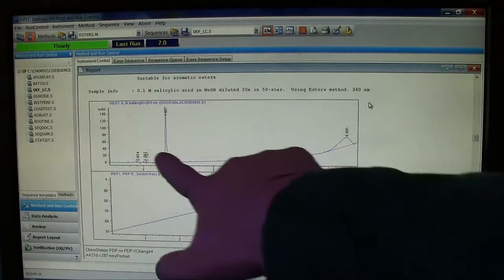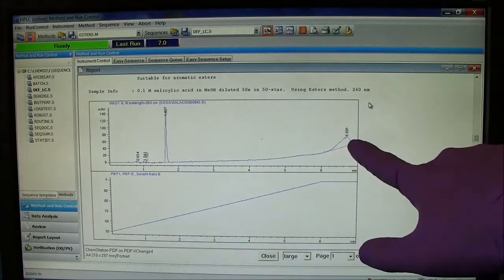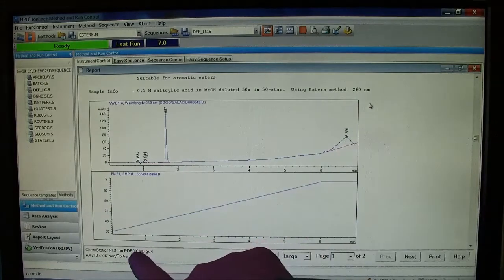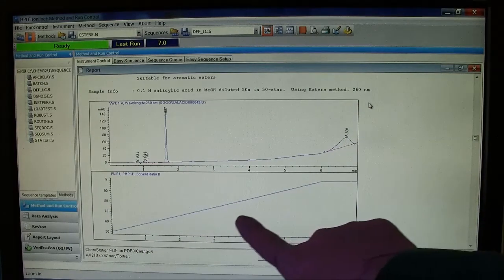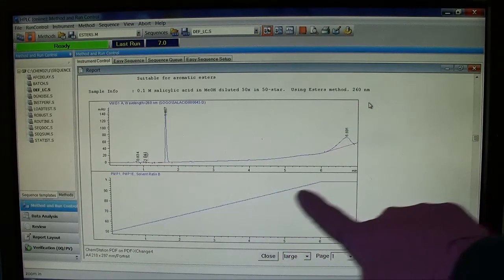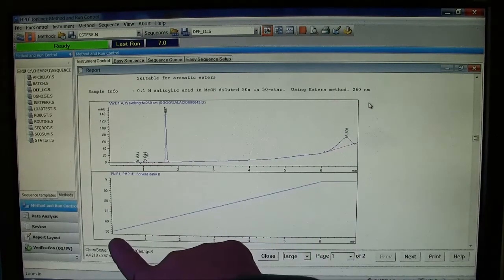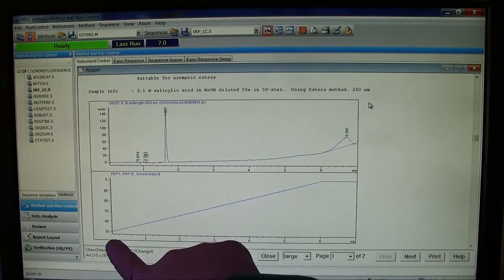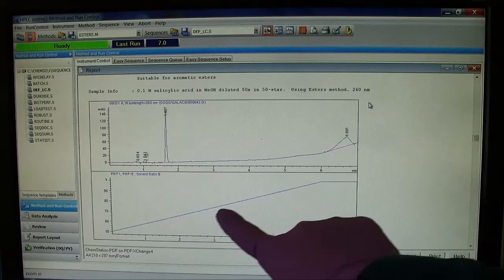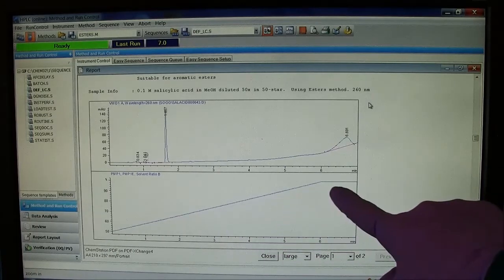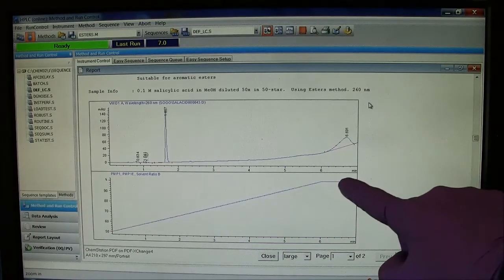The full report includes the original chromatogram and a graph of the solvent gradient. Started at 50% acetonitrile, ramped up to 100% and stayed there for a minute.